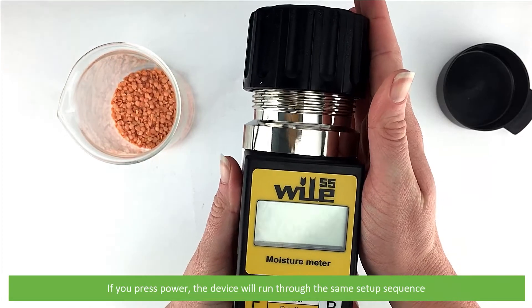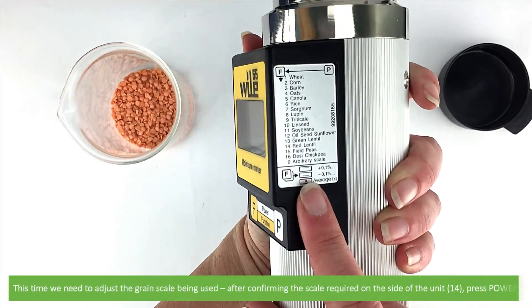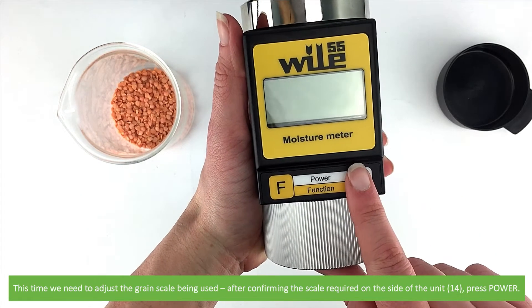If you press power, the device will run through the same setup sequence. But this time we need to adjust the grain scale being used. After confirming the scale required on the side of the unit, press power.